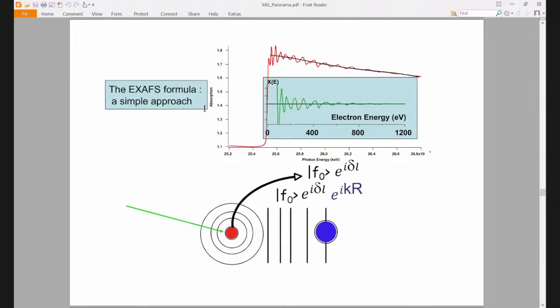Okay, so we make another assumption: a spherical wave at the beginning, which is not easy to realize, and not easy to handle. And at the end, when it reaches the atom here, it is no longer a spherical wave, it's a planar wave. A planar wave, where all the front is just moving like that, not extending like that, but moving like a planar wave.